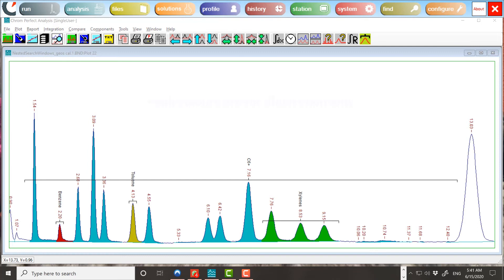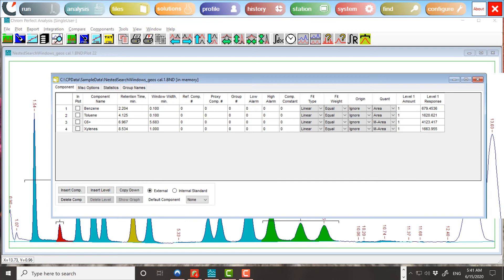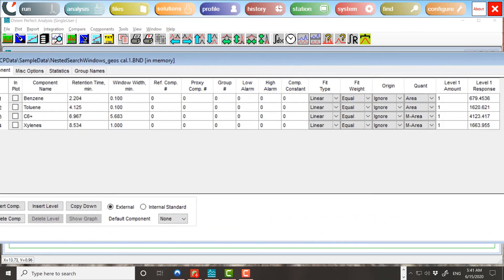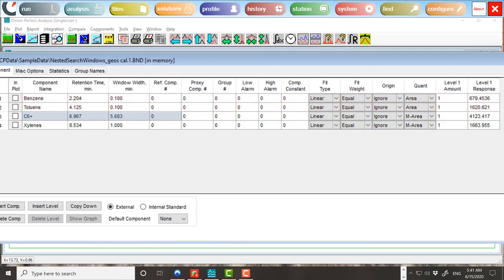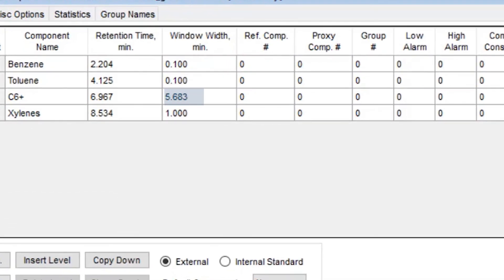An example. The calibration file that was used in this example has four components. As seen in the column on the right, quantization is by area. Two components have ordinary single-peak windows, and two have multi-peak windows. The third component, C6 Plus, has a window wide enough to cover the windows of the other three components.